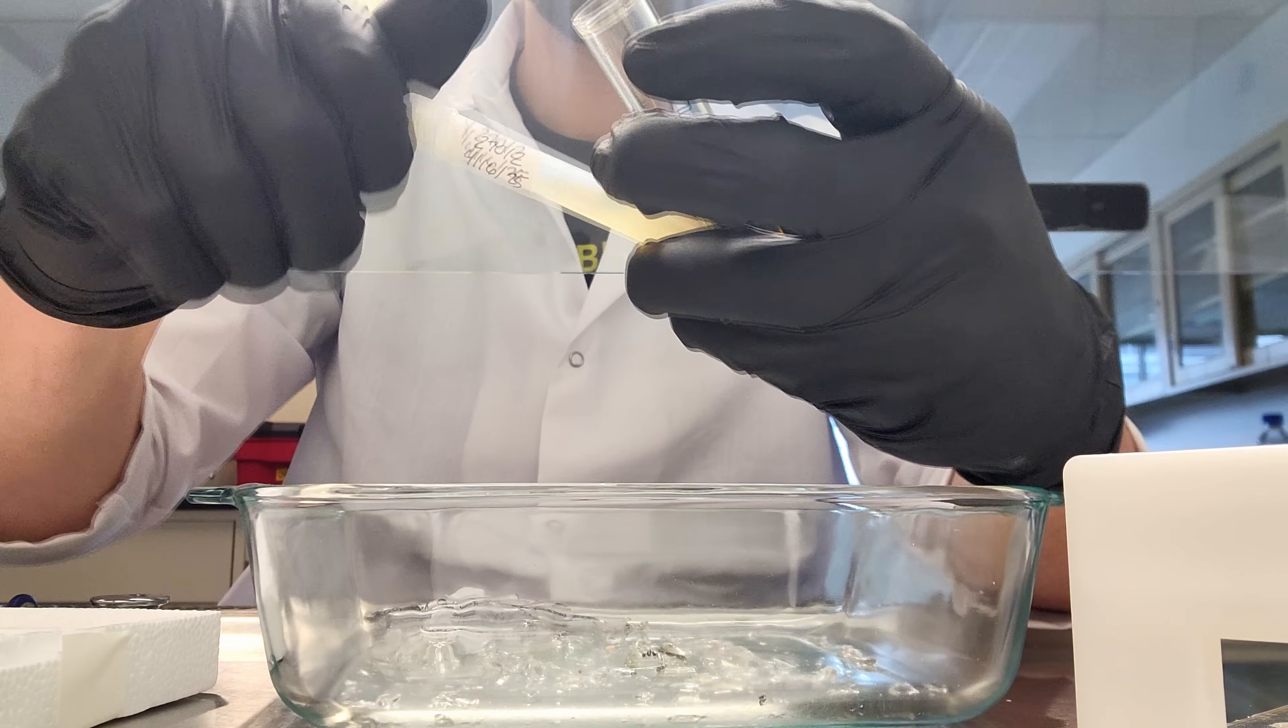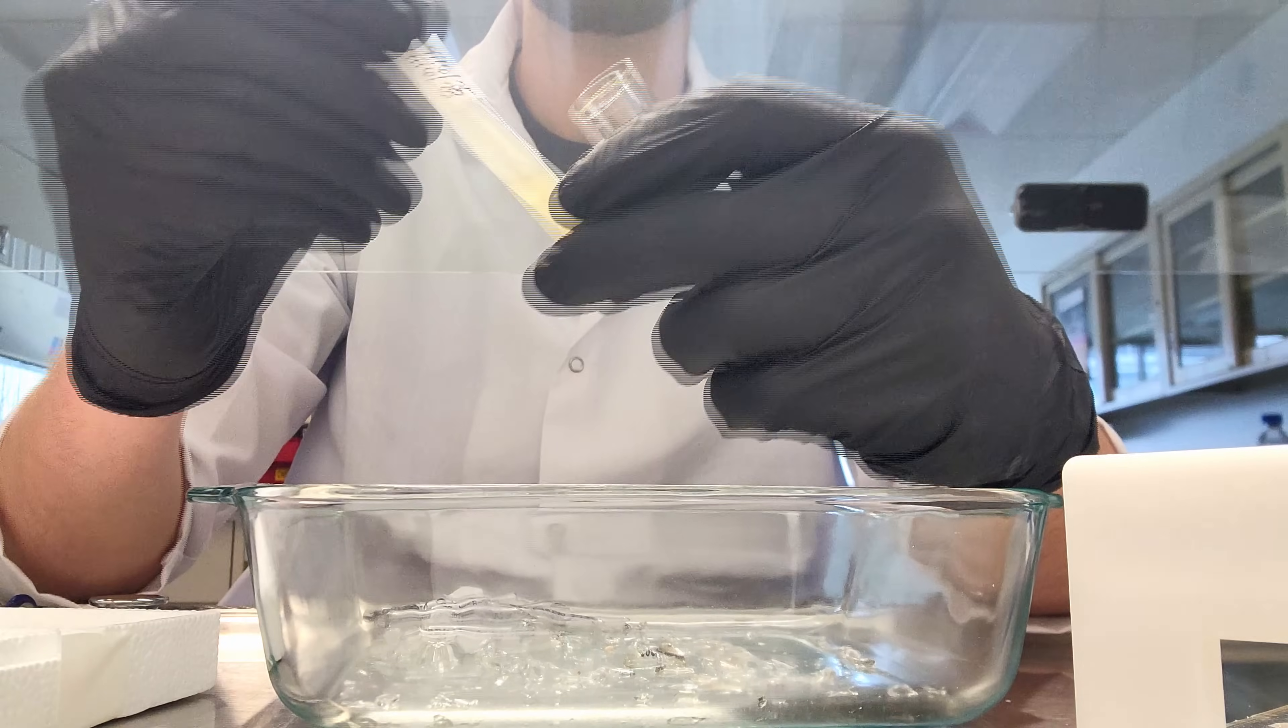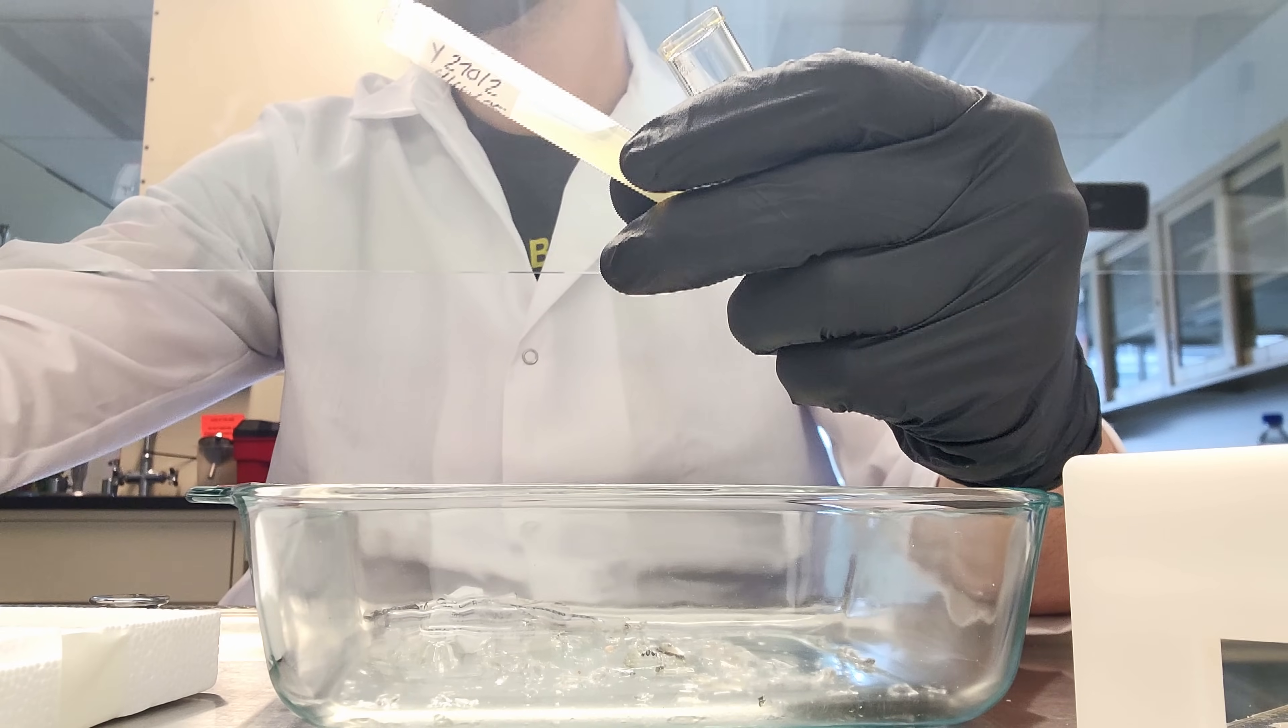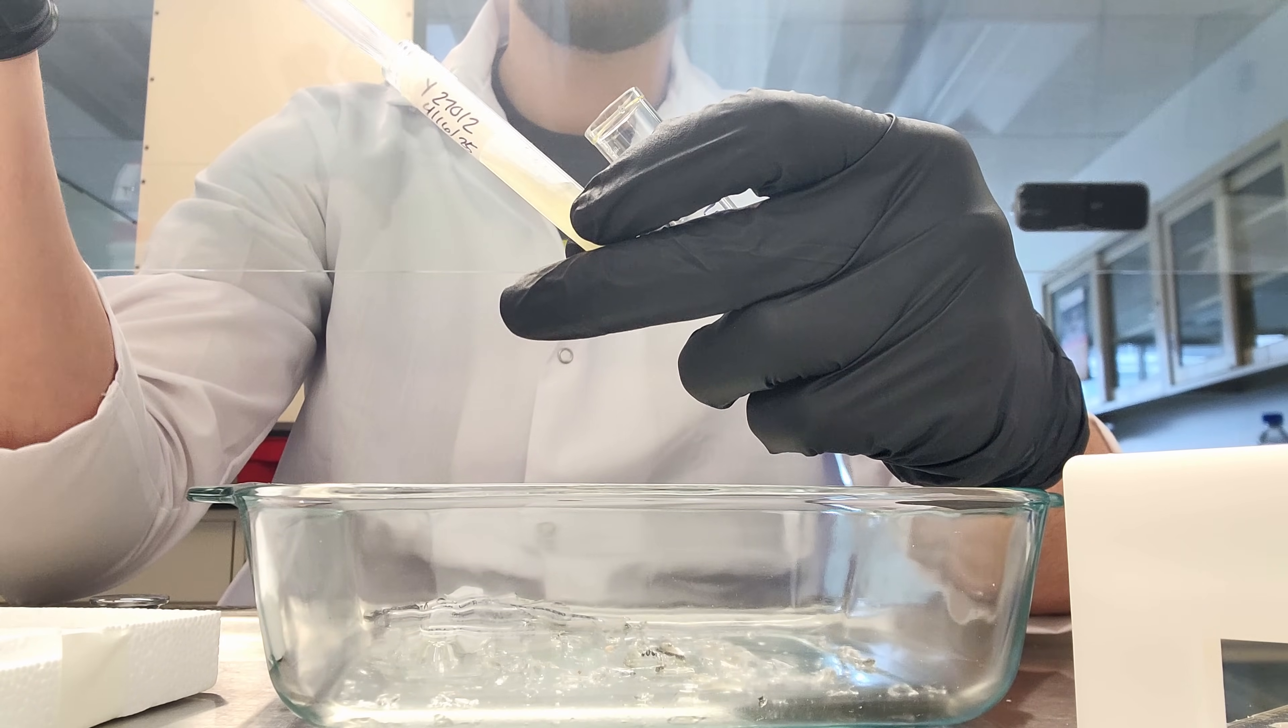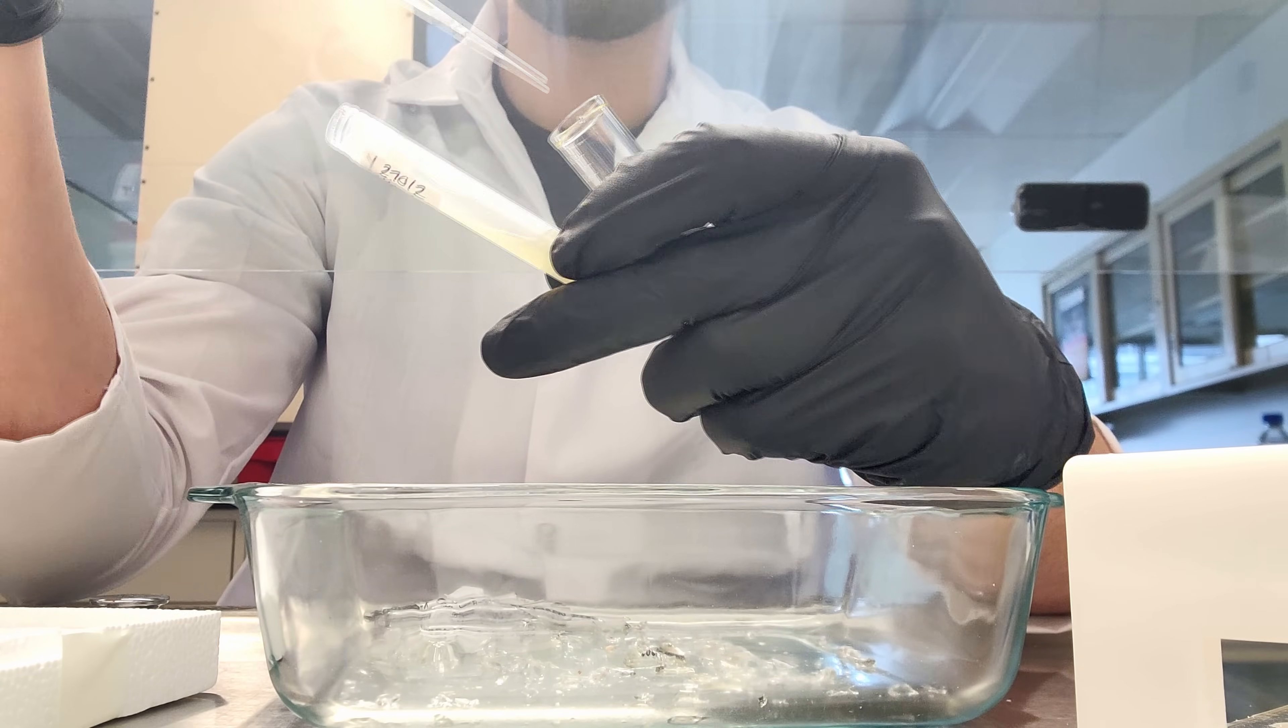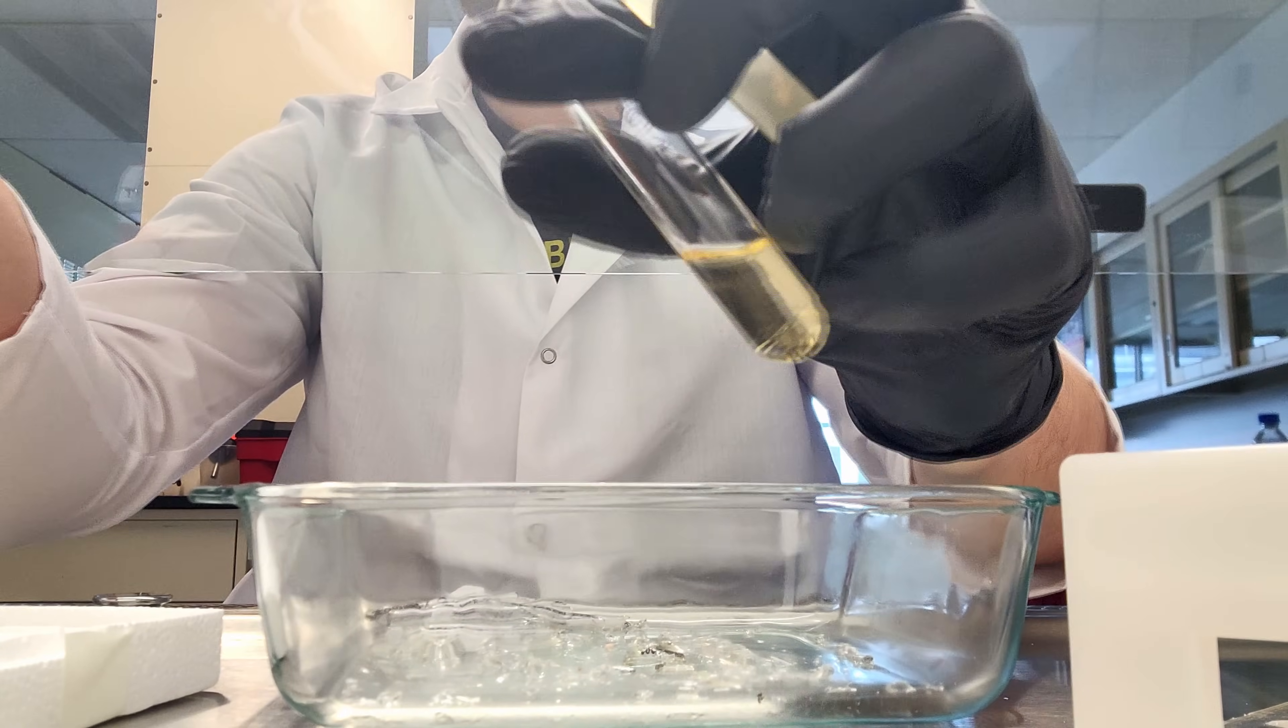I could theoretically—same thing with the glycerol stock—just put a swab or a pipette tip in there and swab it around, then swab that on the petri dish. But I just want to be certain I'm going to get cells on the petri dish. Again, 29 out of 31 samples that I took grew. On the second attempt, the 30th one grew, and then the 31st one, I think it's the fault of the culture collection, or maybe I just have bad hands.